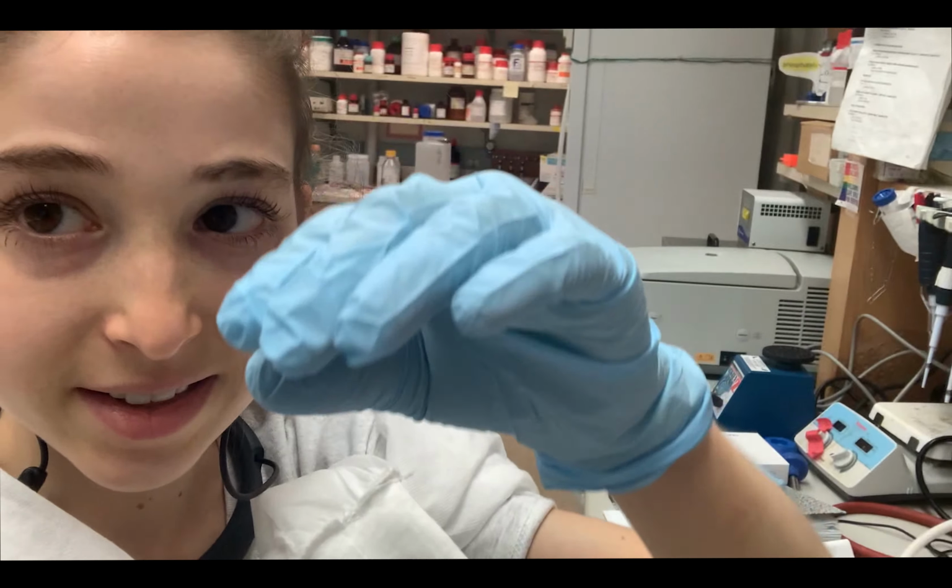You can use pins or whatever. I just use needles because that's what I have, and this is a really bad example because I'm showing with an arrow. Basically what I do is I cut up this paper into little rectangles, like 2 by 1 centimeter squares, which if you don't have a ruler like this, it's super duper handy, because it has the edge, so you only have to measure from one side.